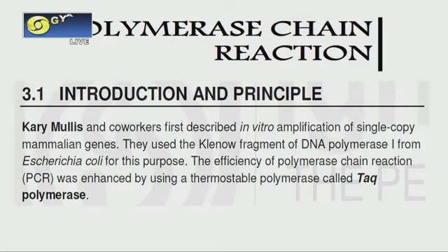You want to know whether one particular gene is present in the genome. So for that, what you have to do? You have to do this PCR experiment. Take any gene, actin gene, for example. Actin is a cytoskeletal protein, and the actin gene is a constitutive gene, that is, present in all the systems. Now, if you want to know whether actin gene is present in the genome, what you will do? You have to do this PCR experiment.